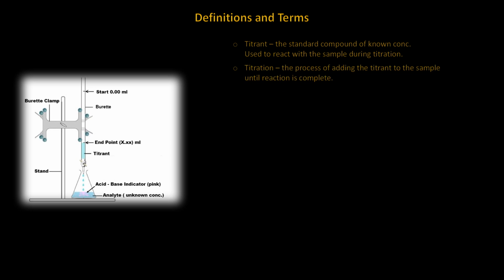The term titration is simply the process of adding the titrant, that is, mixing the reacting reagent with the sample until the desired reaction is complete. The equivalent point is the point of equivalence between the titrating reagent and the sample. It is the stoichiometric ratio between the 2 reacting compounds. We use pure compounds or substances. That is, we use ACS grade substances for titration, among other purposes. These may be considered as standards, but in most cases, these will also be titrated to quantify the true concentration of the solution.